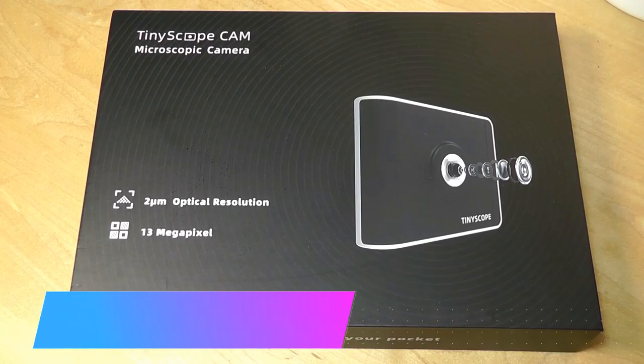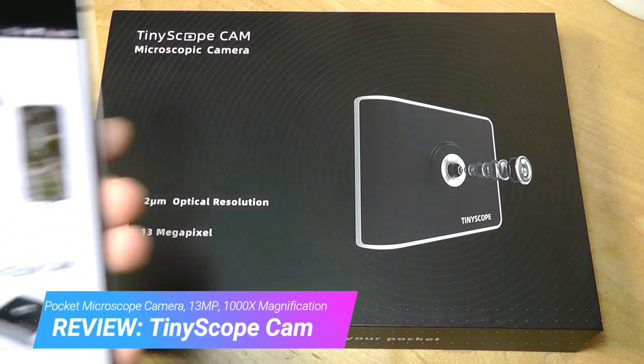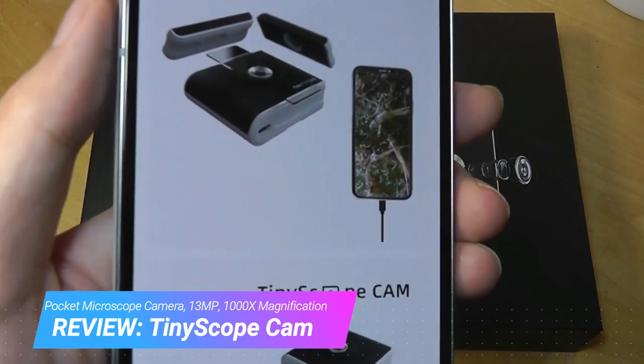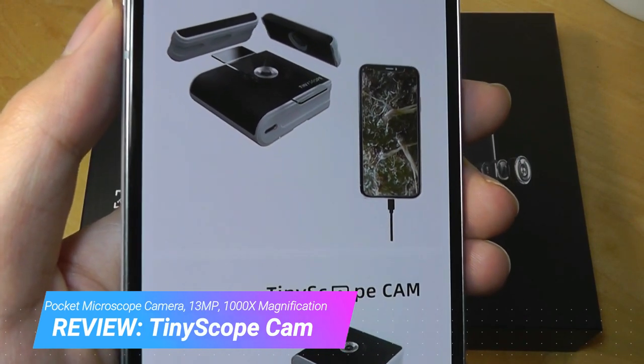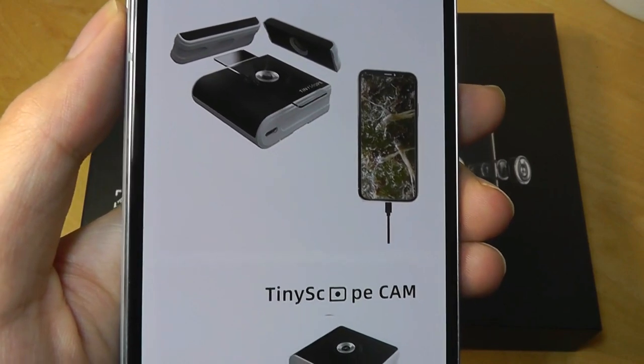Hey y'all, here at OSReviews, today we're taking a closer look at the TinyScope Cam. This is a digital portable microscope that enlarges objects up to 1000x magnification, and it can attach directly to your smartphone either using a wire, or it also comes with a Wi-Fi box that you can use to wirelessly share the image onto your phone or tablet's display.